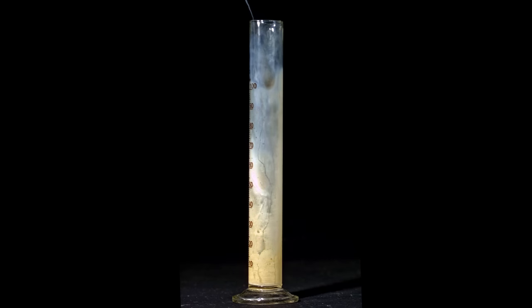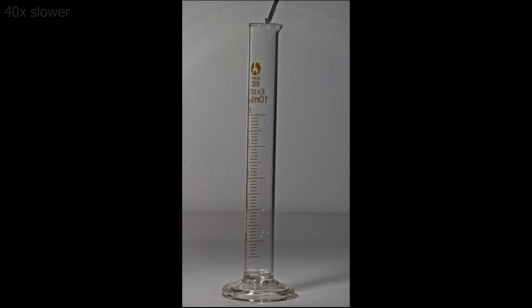By the way, the concentration of initial substances can be adjusted, so that the reaction will proceed silently and leave the inner walls of the vessel covered with elemental sulfur.